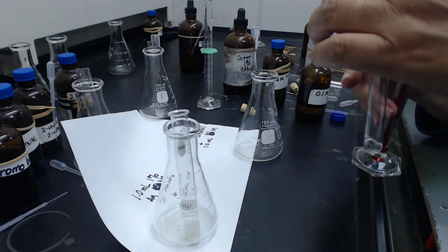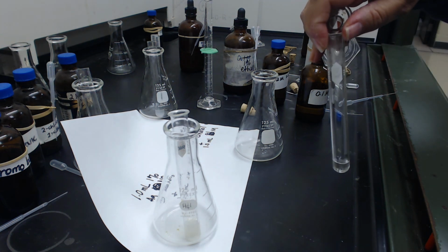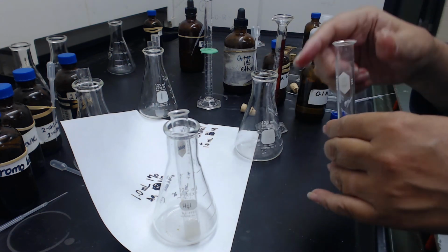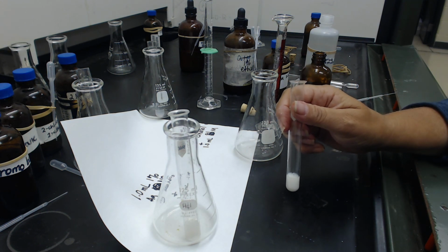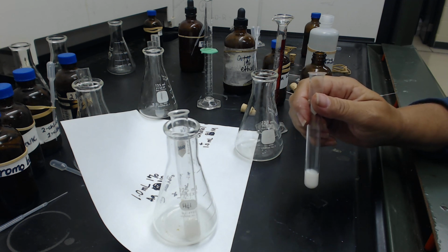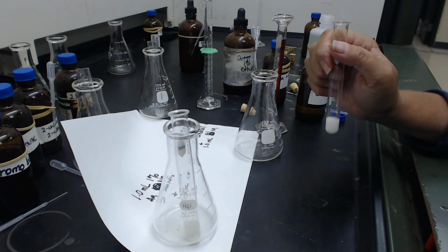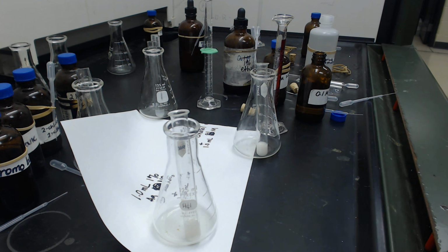Now I'm going to do the same thing. I'm going to reset it and hit the timer as I pour it in. Start, pour it in. Again, it happened almost immediately, about 2 or 3 seconds. So I don't believe the concentration of the silver nitrate had any effect. In both cases, as long as there was some silver there, the reaction took place, but the concentration of the silver nitrate did not affect it. They were both about 2 to 3 seconds.